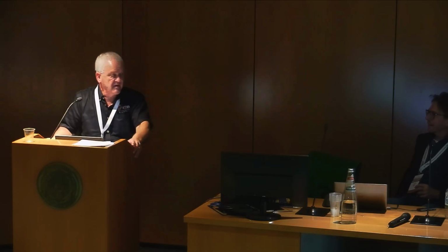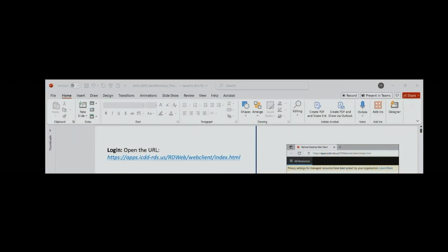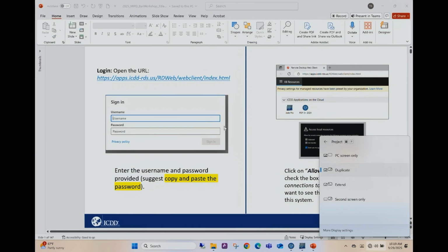So for the last presentation of the day, I'm going to talk a bit about PDF databases. The emphasis is on data mining within the database, with some examples. Then, as time permits, we'll hit a couple of comments about phase ID, and a little bit of phase ID with the JADE software. So that's what we're going to try to cover in the hour plus that we've got here.